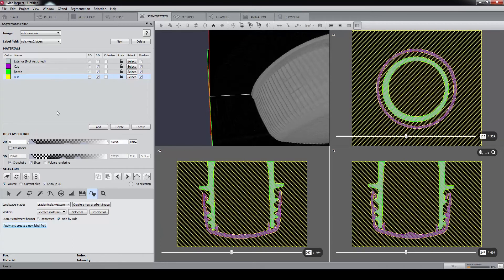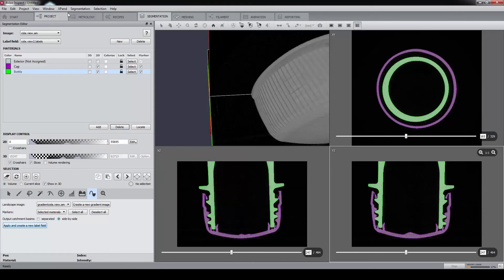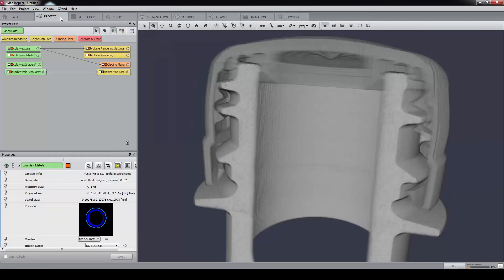We can remove the material rest, which we don't need anymore. Let's go back to the project view, where we have the result.